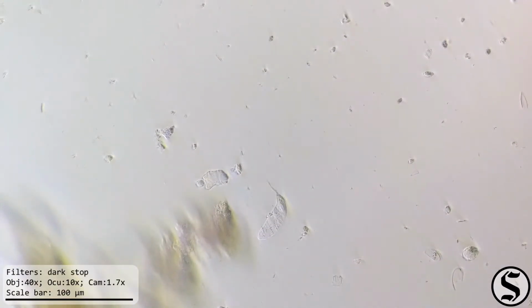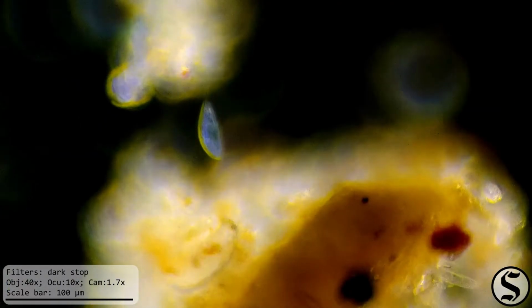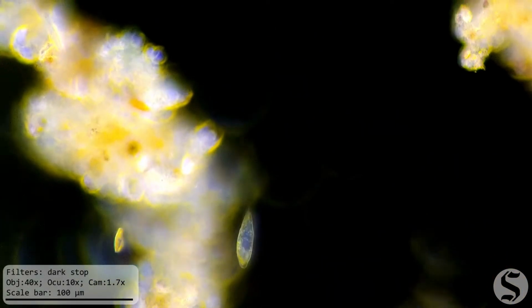I thought that some oblique illumination really highlighted some features. Then it decided it really liked the sediment while I was trying to look at it in dark field, but we still got some footage.